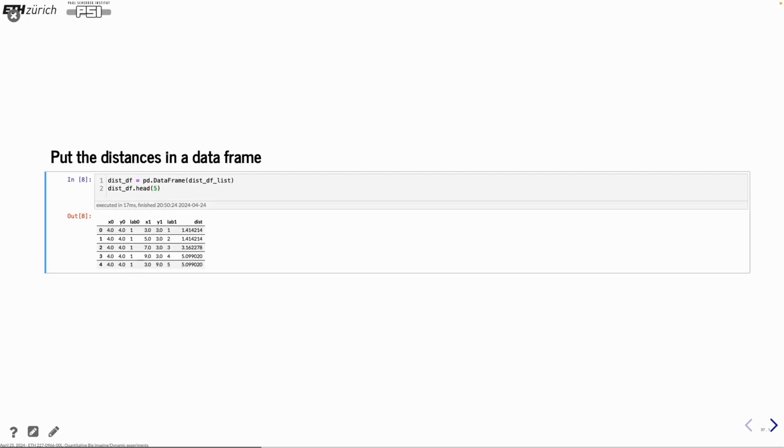And the decision here is just to take the first hit. In the end, we want something that has a unique connection from each point in one image to the next. And if we would take the other one around, it would be confusing and it wouldn't end up in a good tracking.